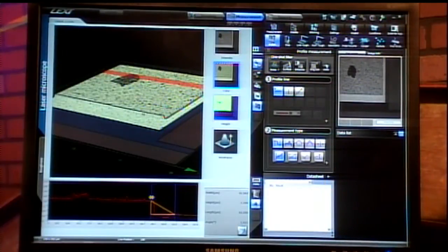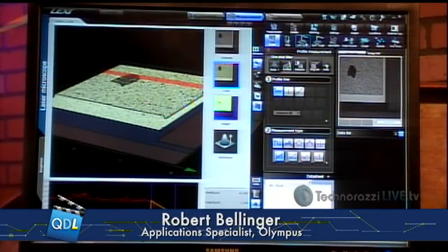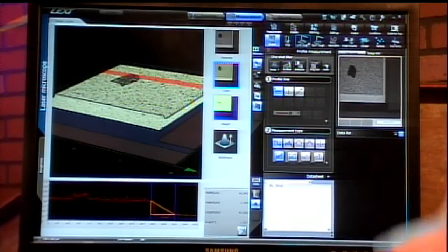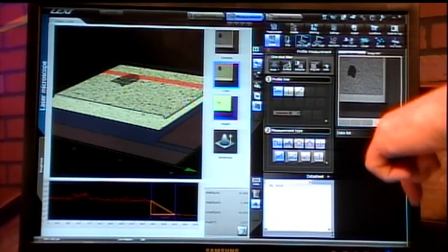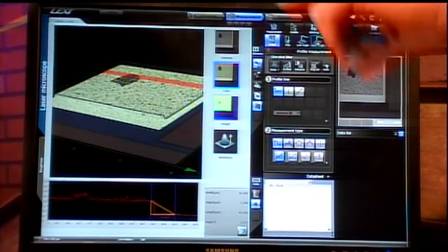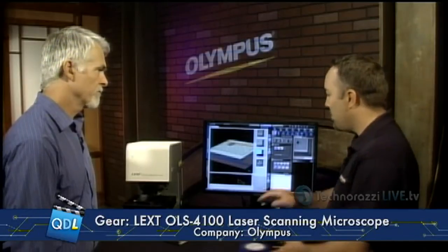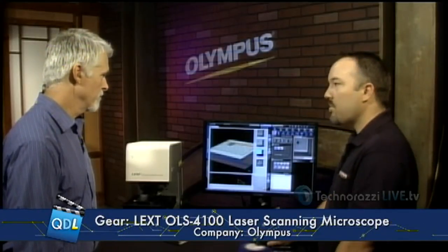This brings in the measurement side of the tool. It can do profile measurements for height, step, and cross-sectional area. It can do line roughness measurements, where we can measure tiny little peak roughness on the surface and get a quick roughness measurement. The tool even has an interface to do large area line roughness scans as well, and surface roughness — if you want to select an entire area and get the roughness information. We also take all kinds of geometric measurements, like circle-to-circle measurements or best-fit point measurements. You can do volumetric measurements as well — all kinds of volume measurements for depth, like a scrub mark — if you wanted to know the volume that was removed, you can measure what's left and what was removed, and get the difference.